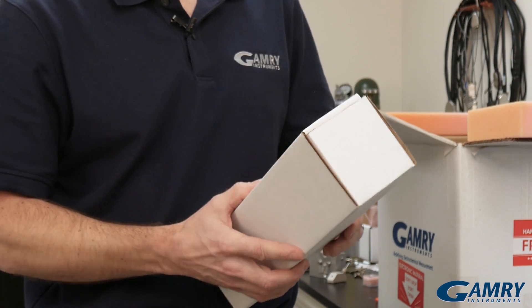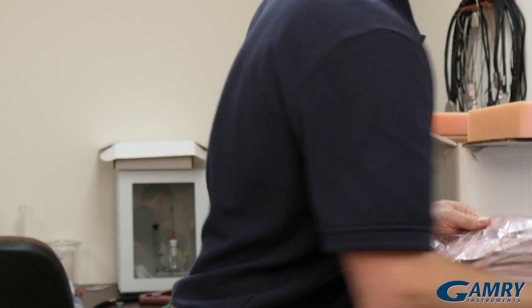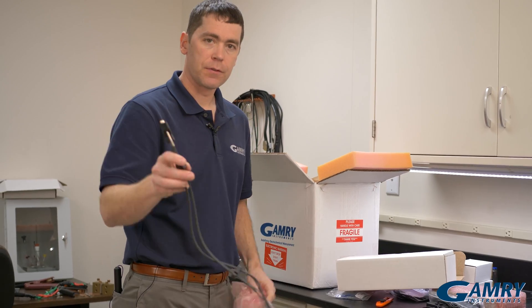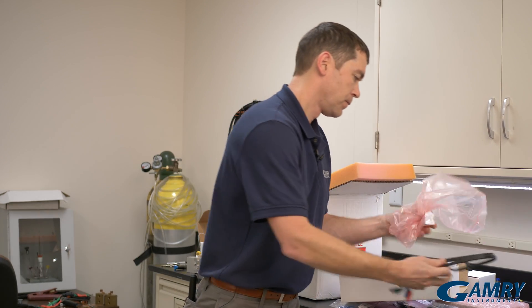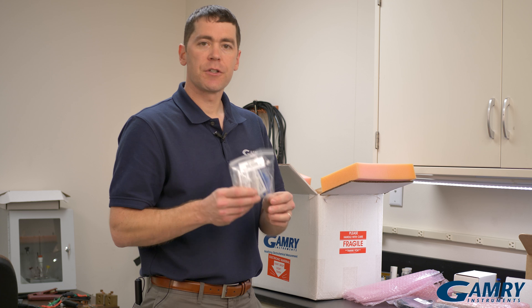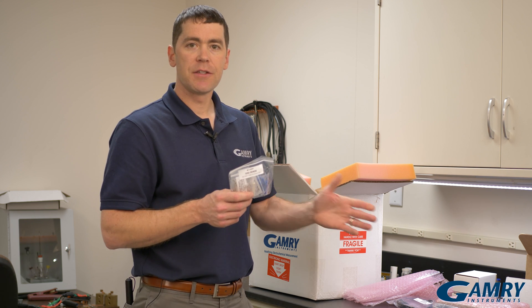Then we come across the cell cable — the Reference 600 Plus cell cable. Inside that box there's also a number of connectors for the ends of the cell cable that let you connect to different types of cells.